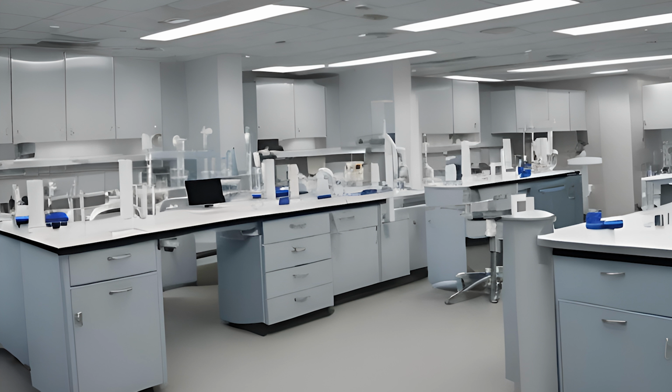This equipment needs to be tested on a regular basis. Frequently, it's tested on a weekly basis for your eye washing stations. Employees need to know the location of these, and you need to teach them, when you bring them on board your lab, how to use the safety shower and the eye wash station.